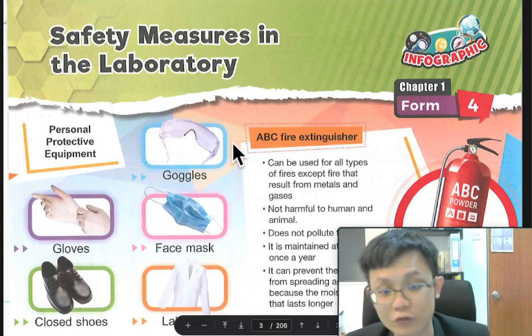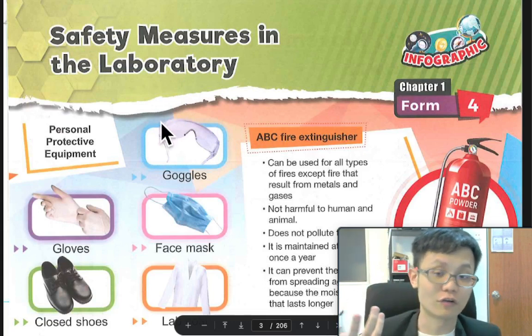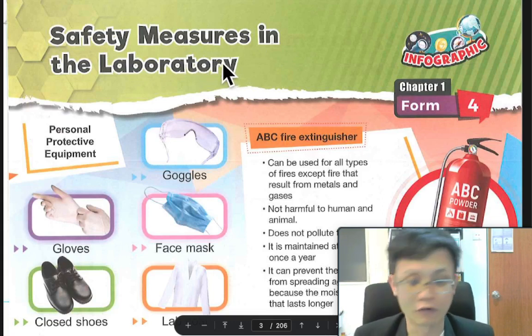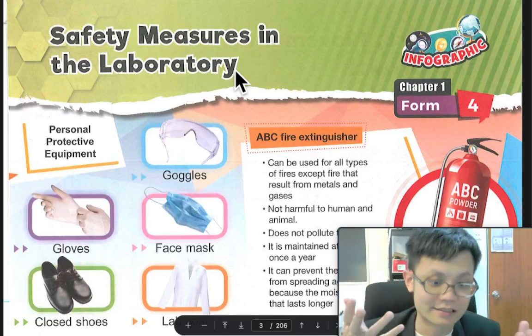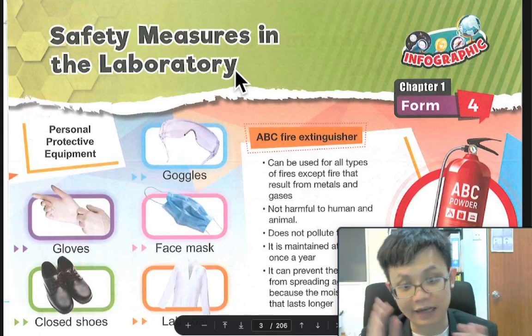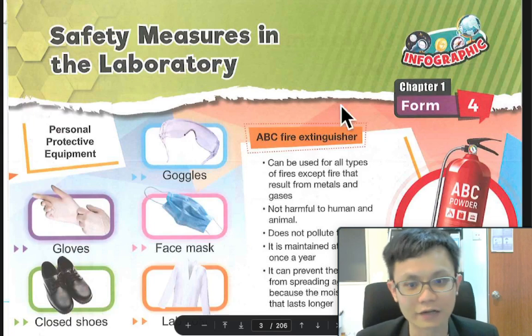So let's dive into chapter 1, safety measures in the laboratory. It will be the same as your PT3. When you went to Form 1, your first chapter was safety in the laboratory. For Form 4, it's not exactly the same, but almost the same as Form 1, Form 2, Form 3, Form 4 and Form 5. They will link together, and if you take a university course, it will also continue to link. So it will be good for you to know.